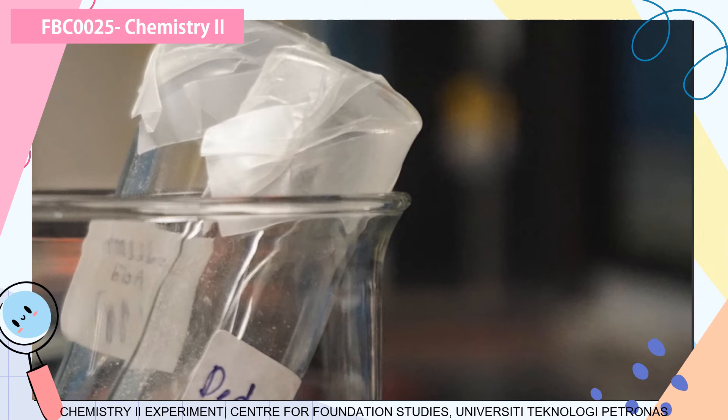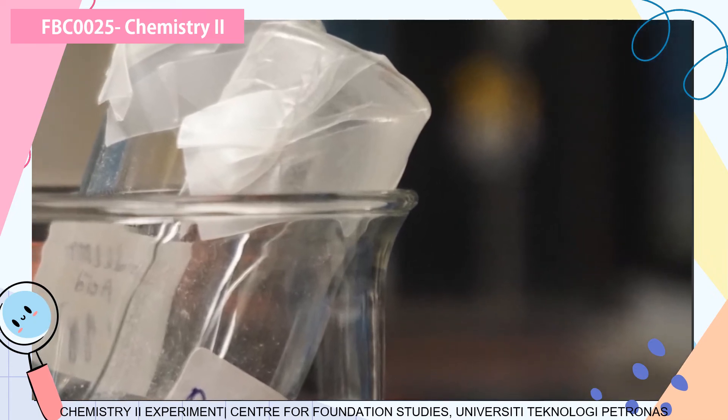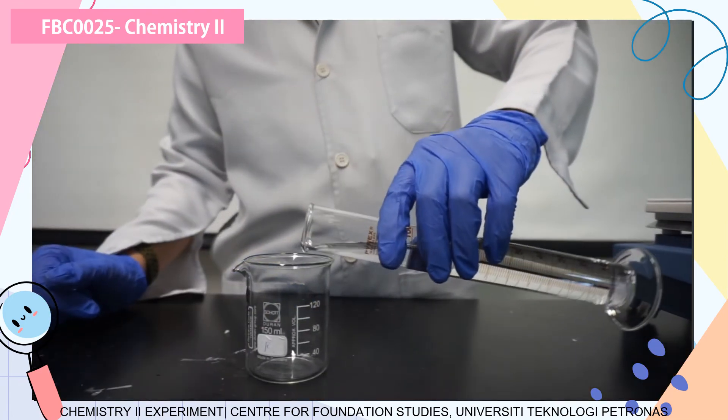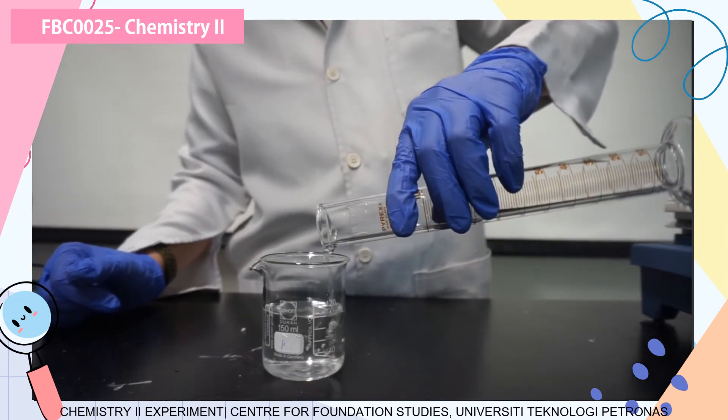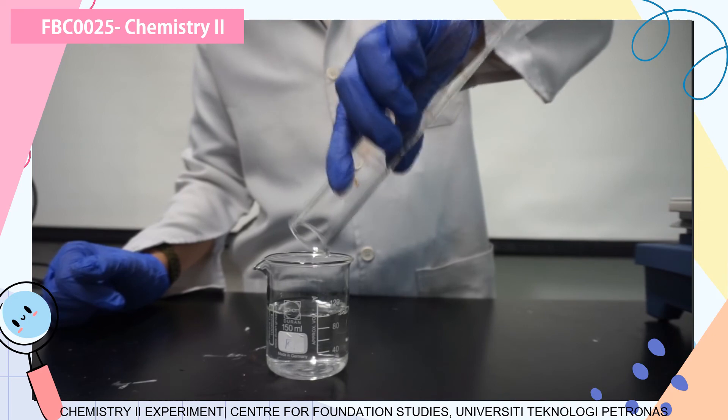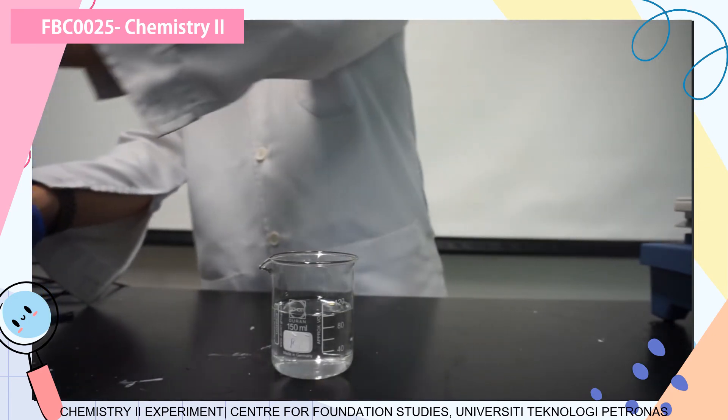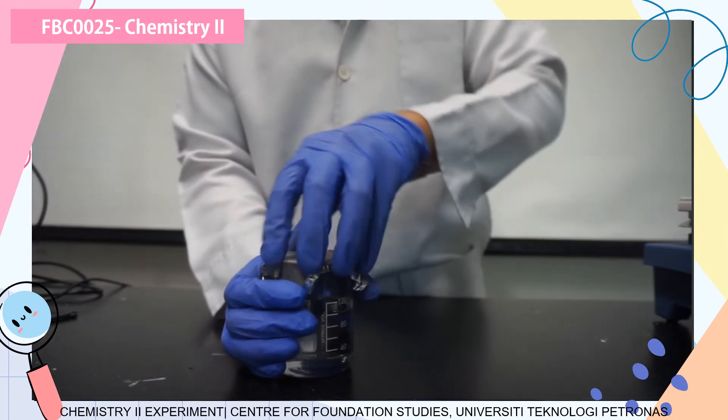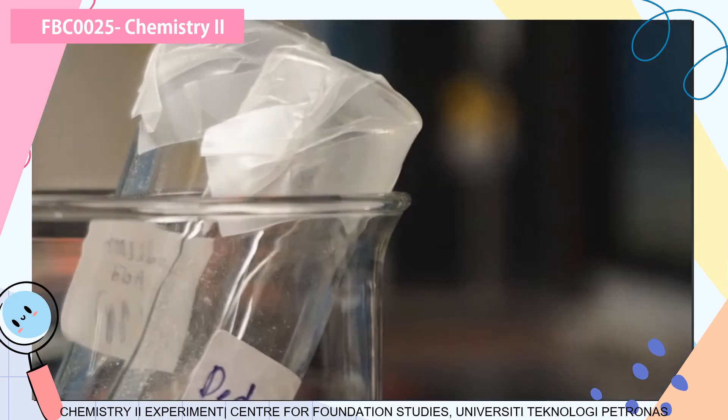In this second part, you have two subparts. First, we want to determine the boiling temperature of the solvent or the water. You're going to have your water here, measure it by the measuring cylinder, and transfer it into this beaker. Once we have transferred it into the beaker, we are going to take the aluminum foil and close the beaker, making an aluminum lid.